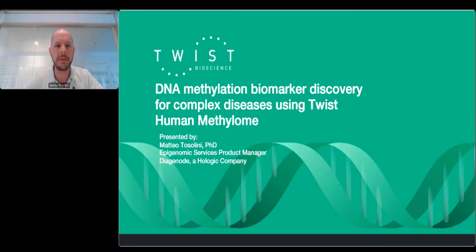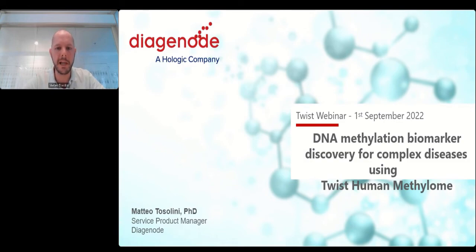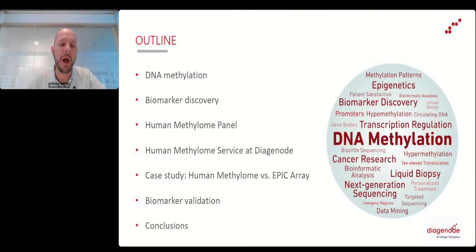So, the title of the webinar is DNA Methylation Biomarker Discovery for Complex Diseases using Twist Human Methylome. And today on the webinar, we're going to talk about doing a small introduction on DNA methylation, what is biomarker discovery, what is the Human Methylome Panel, and how at Diagenode we perform services using Human Methylome. Then I will present to you a short case study where we compare data from Human Methylome and from the EPIC array. And then I will explain how we can go a little bit further, going from a biomarker discovery to a biomarker validation, and then drawing some conclusions.